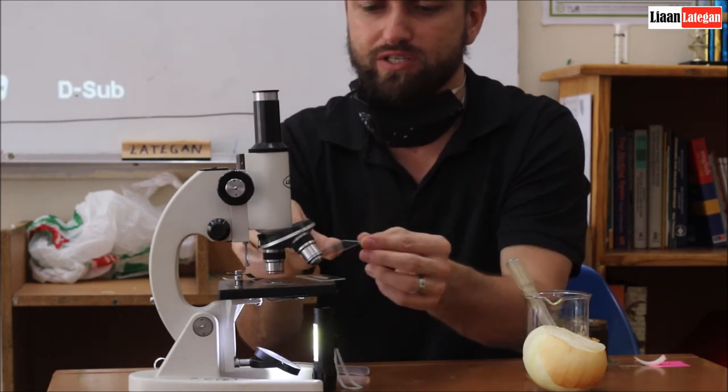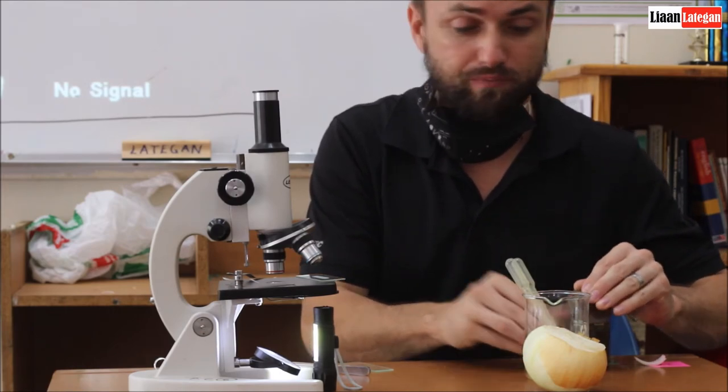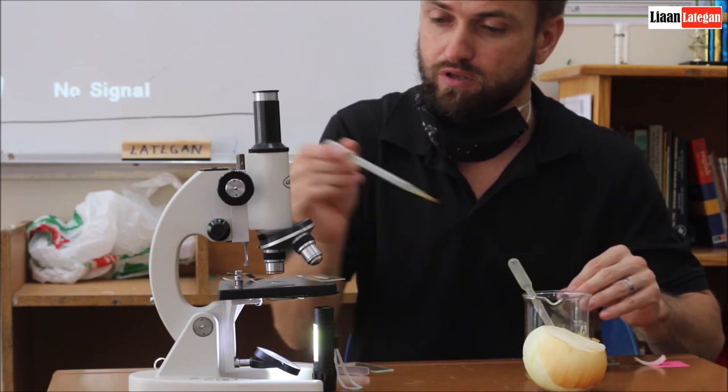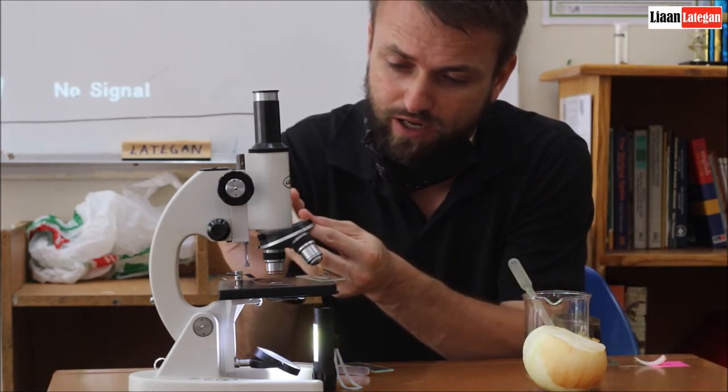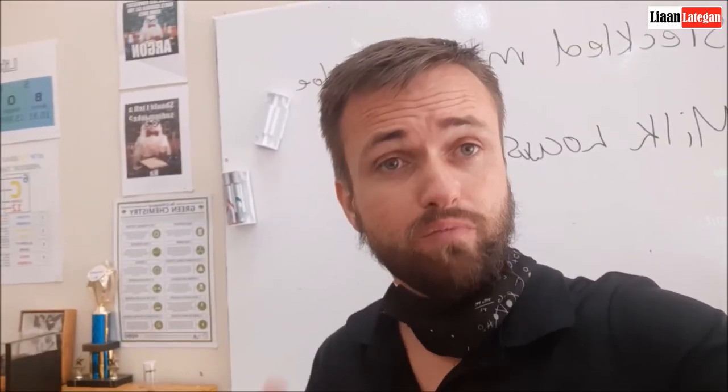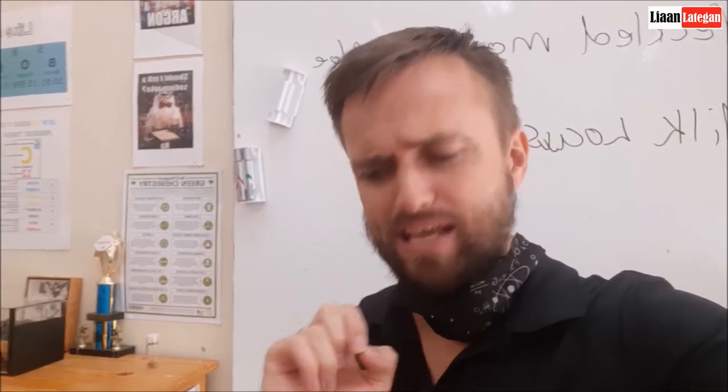So I then want you guys to have a look and see what it looks like if I put one drop of iodine on it. So I'm just going to drop one drop of iodine solution.